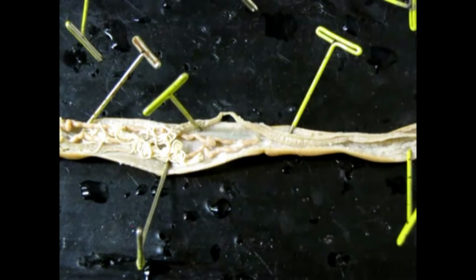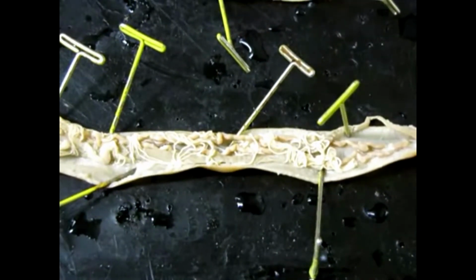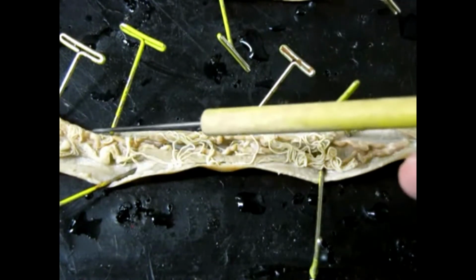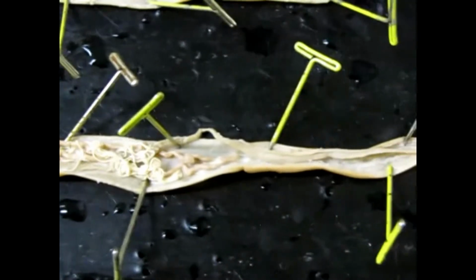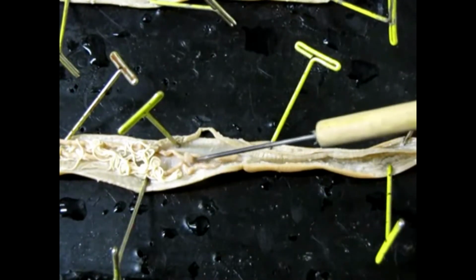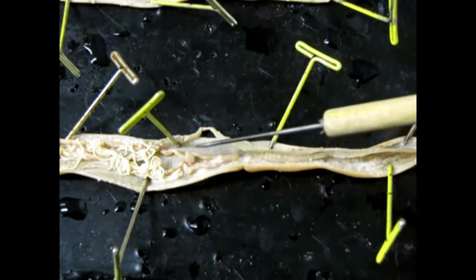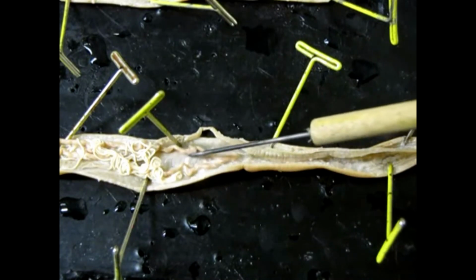Now, the next thing that we need to note is that the rest of the body cavity is largely filled with a series of long, coiled tubes of various thicknesses and lengths. We'll start at this end. You'll note there are two thick round tubes here and here. Okay, those are the uteri. Okay, so that's plural for uterus.